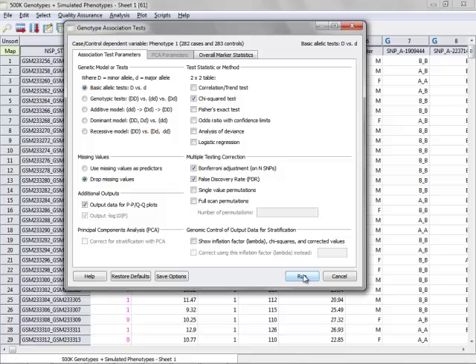This now is scanning through all 500,000 variables for the 565 samples and it's doing a chi-square on each SNP to test association with the case control status.